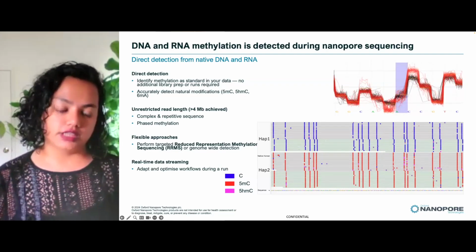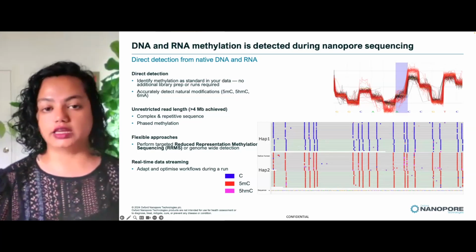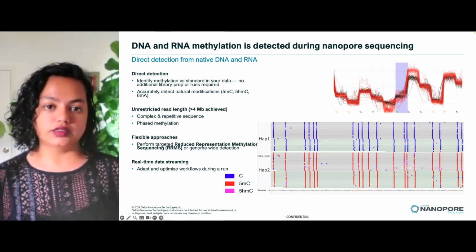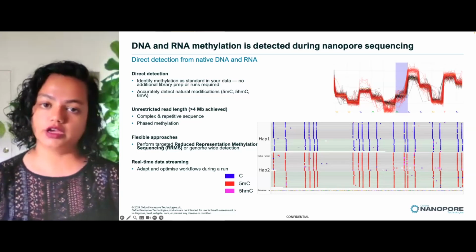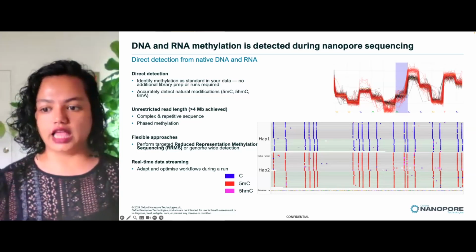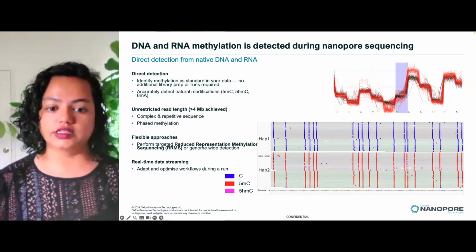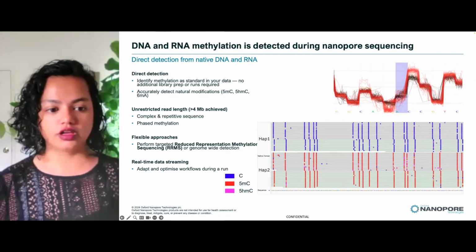In contrast, nanopore sequencing can directly detect methylation status of both DNA and RNA without any additional library prep or sequencing. Oxford Nanopore sequencing is also read agnostic, meaning it doesn't matter if your DNA is 20 base pairs or 4 million base pairs. This versatility allows nanopore sequencing to sequence CpG islands, providing a comprehensive and precise analysis of DNA methylation patterns across diverse genomic regions.